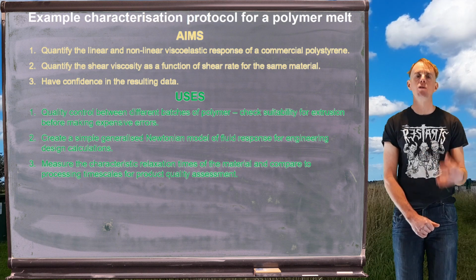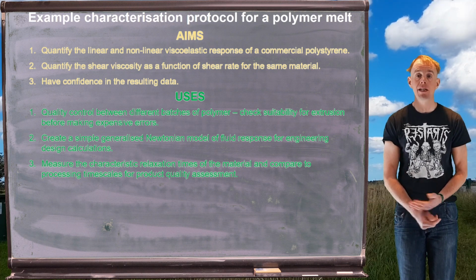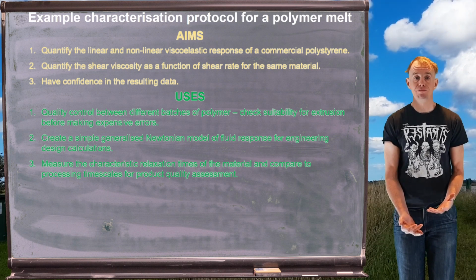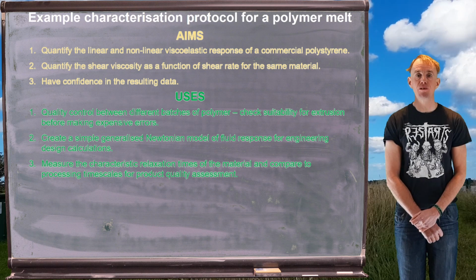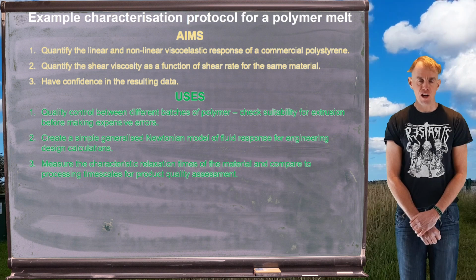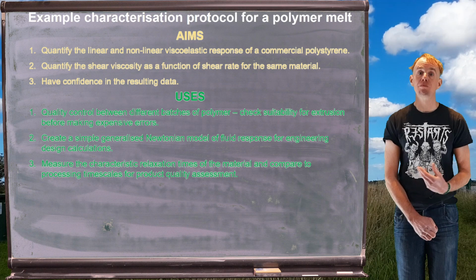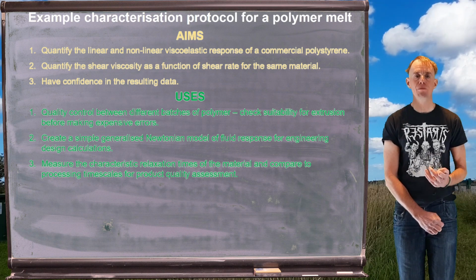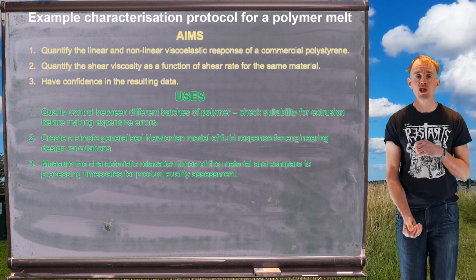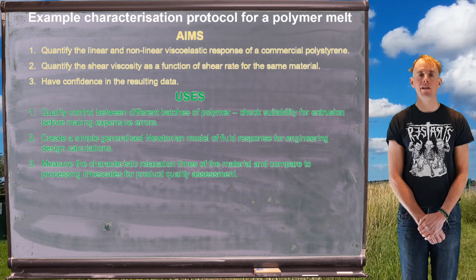That's going to be a function of the longest relaxation time of the material. It may not be an issue. For many uses, if there's a little bit of embedded stress within the final product, it may not matter. However, there are times it does. For those of you who have soaked your mobile phone, taken the SIM card out and dried it with a hairdryer, only to watch it crinkle up into something shaped like a Pringle, as a result of stored stress being relaxed, you will realise that sometimes stored stress can be a problem. So, if we want to gain a measure of how long stresses take to relax, these kinds of data are going to be very, very useful.